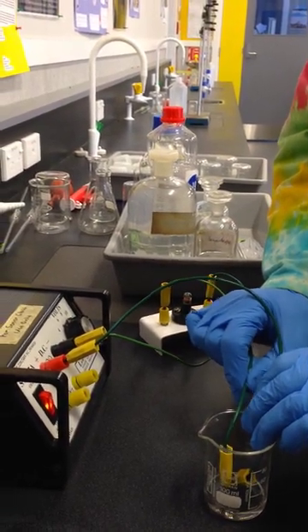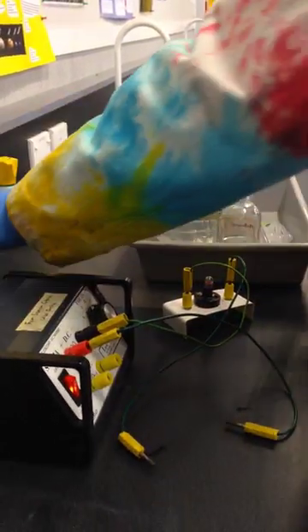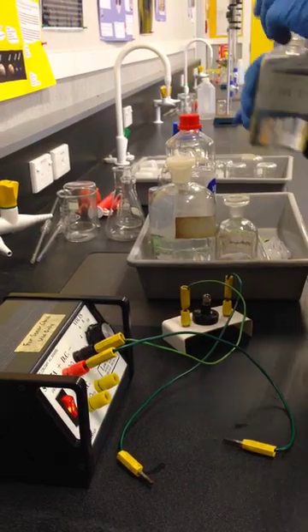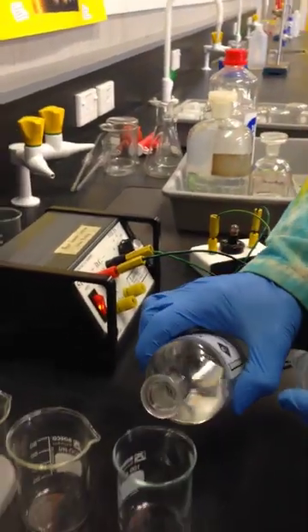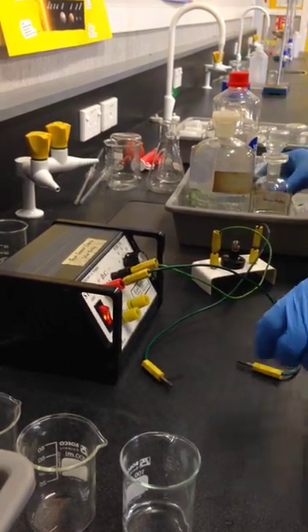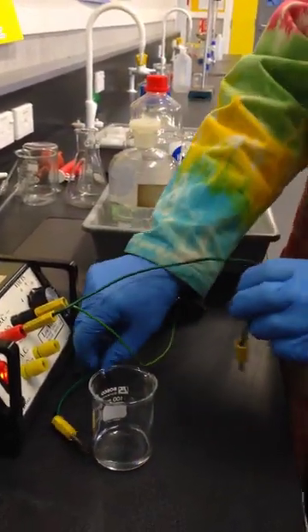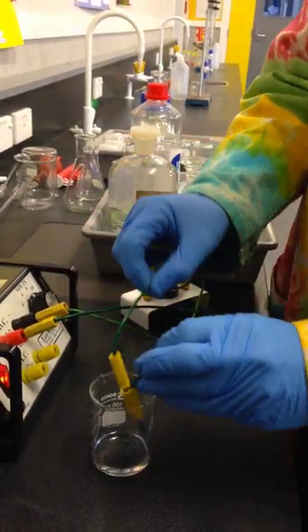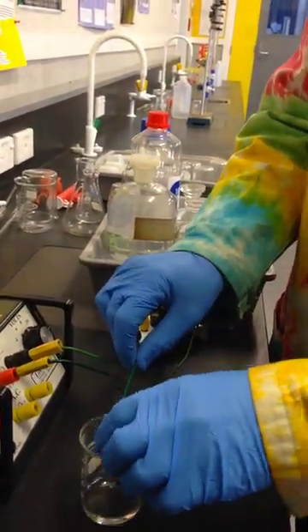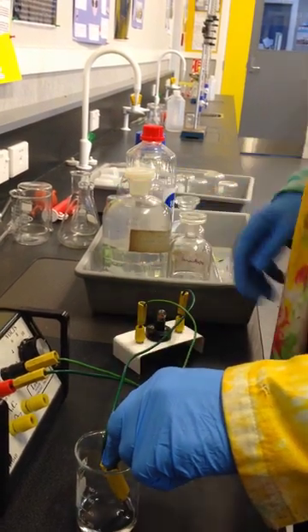I'm not sure if it surprises you or not. I'm going to then do the same with methanol. So I'm going to take methanol and put the electrical leads in, see if that sets the light bulb off, but it doesn't.